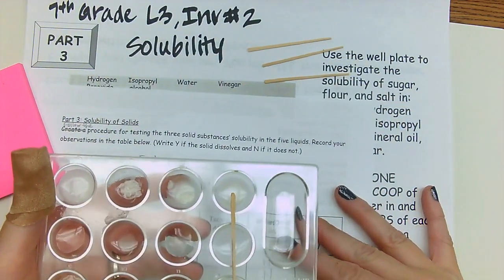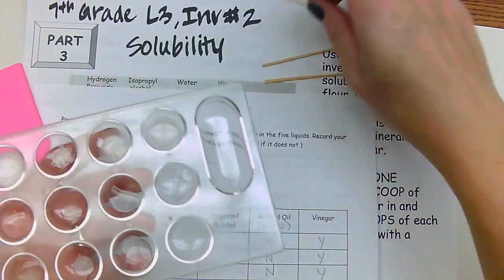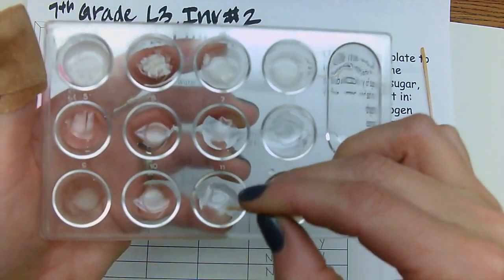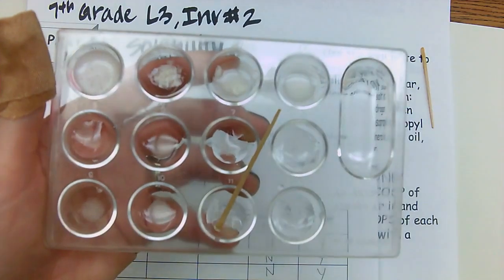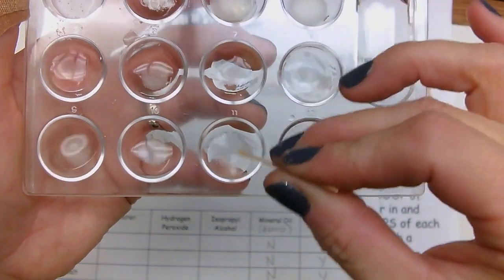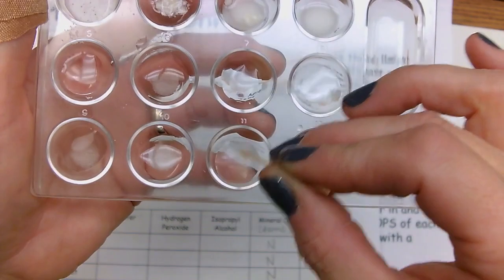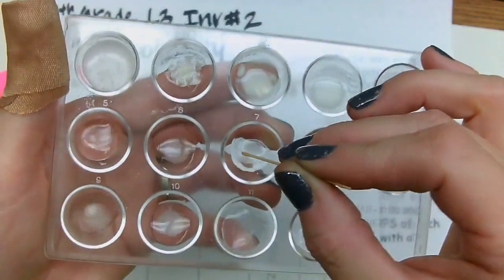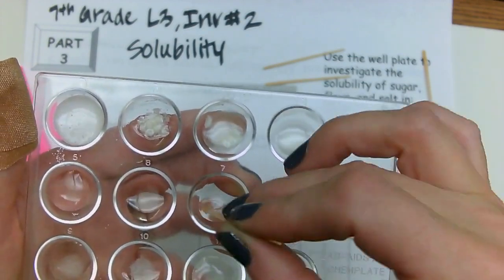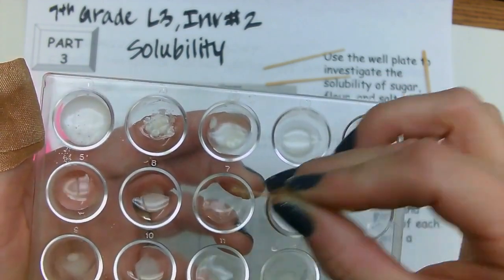Let's look at isopropyl alcohol. Oh, not isopropyl alcohol, water. So you can transfer this to another person and start stirring water and salt. Let's see if that dissolves. If you look at that with my finger underneath, it is pretty much gone. And then the sugar. So the salt is a yes. The sugar, I see a lot less salt than we started with, so the sugar is a yes.